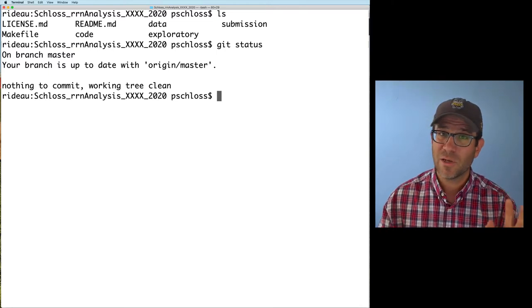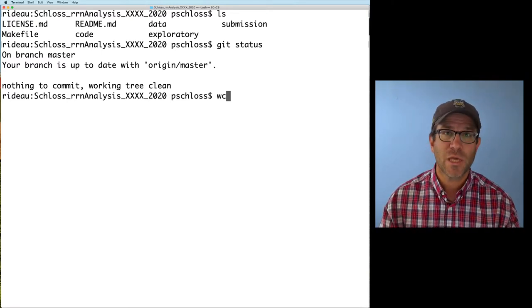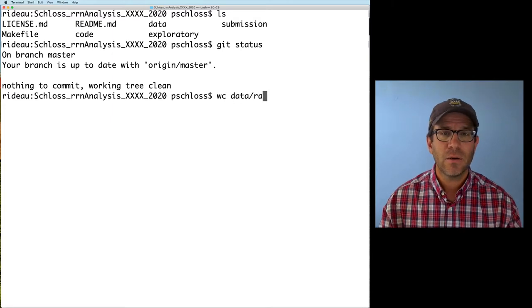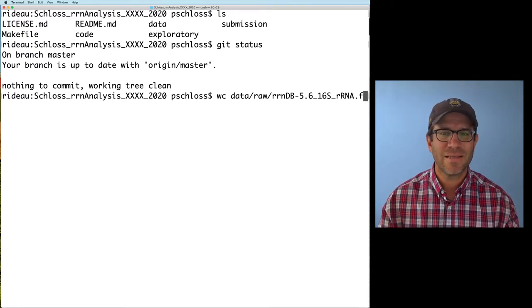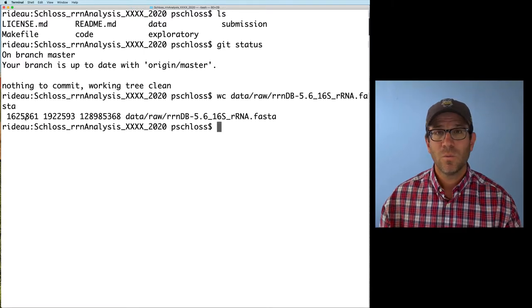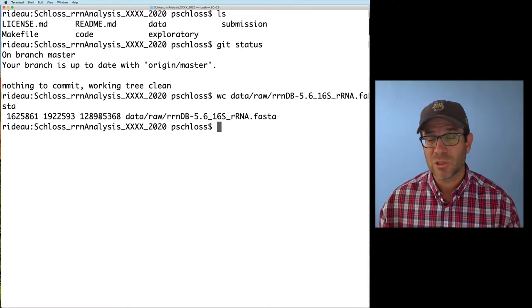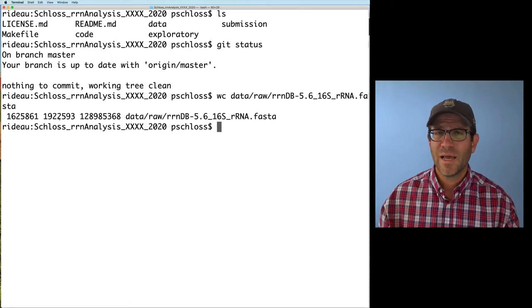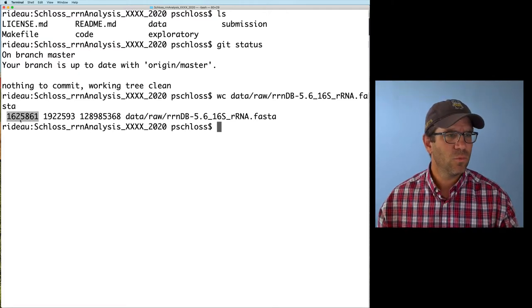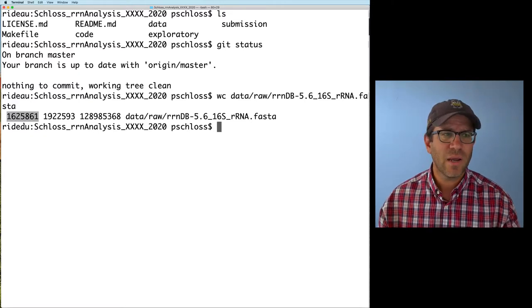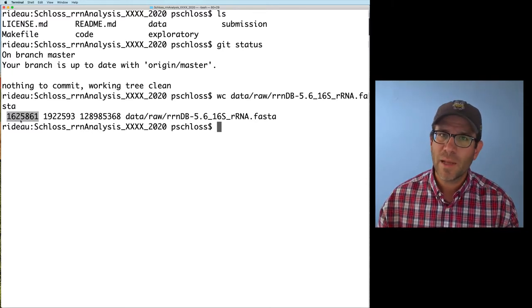That involves using a command called wc, which I think of as short for word count. So we can say wc data/raw/rrnDB-5.6_16S_rRNA.fasta. The output tells us the number of lines, words, and characters in the file — a word being any text separated by a space. This tells us there are about 1.62 million lines. I don't think that's the number of sequences though.